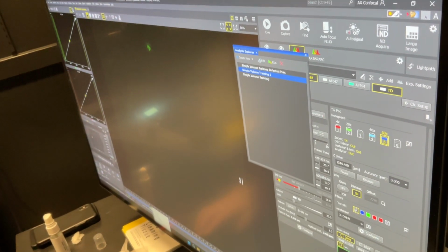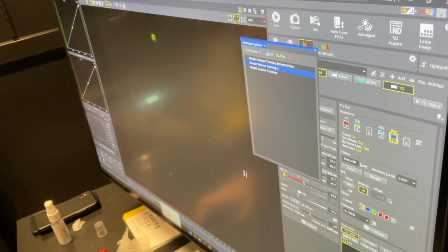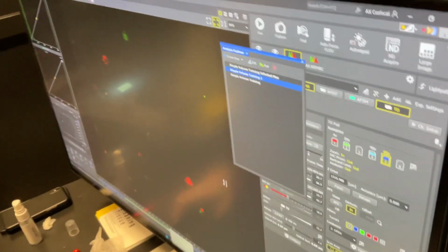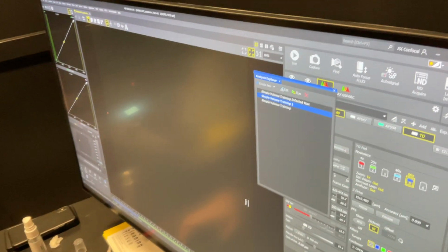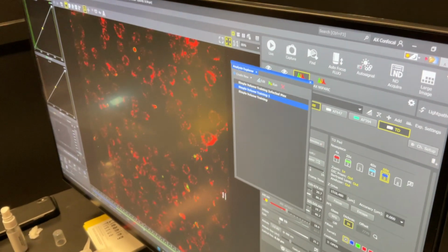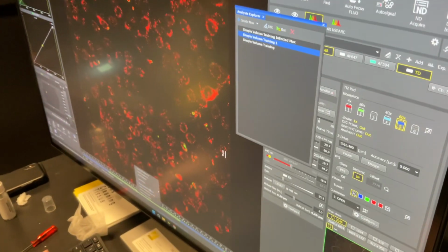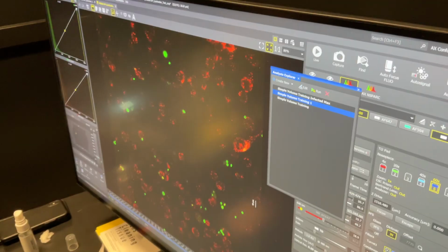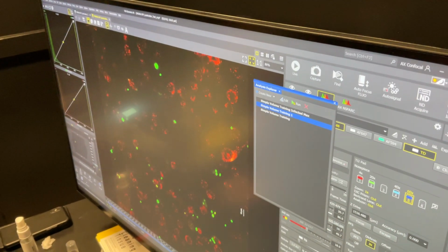that's probably the starting point. So I'm going to hold down Shift, I'm clicking and dragging, and I'm going to just keep going until right there. Okay, so that's the subsection, right click, keep selected frames in Z. Okay. And we're just going to recrop it. That's easier. So you saw that was a click and drag.